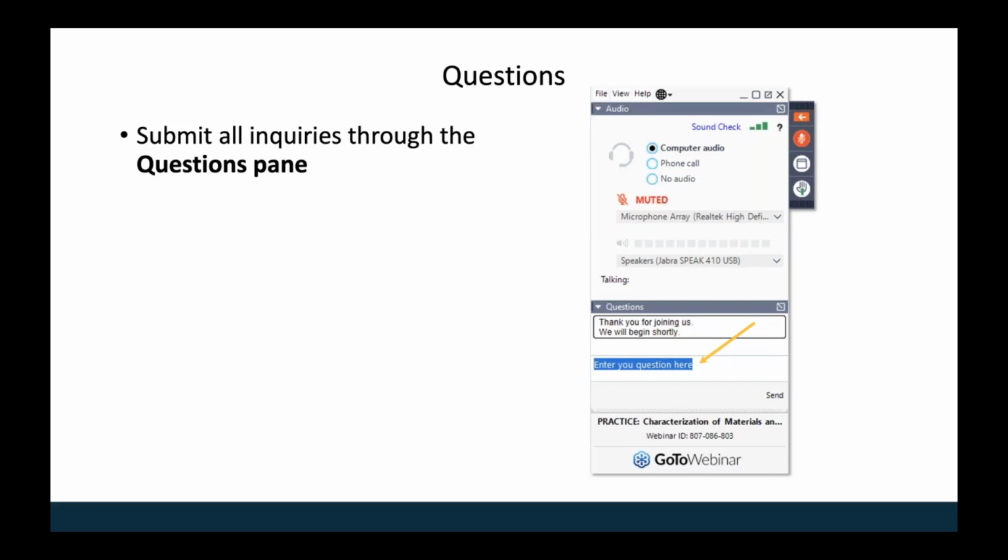Okay. And another question, Colin, great talk, thank you. The question is, how did you simulate the plasmon contribution to diffraction? In the laziest way possible. So plasmons essentially have a Lorentzian distribution. And so if you just pick a characteristic energy and figure out what cross-section you want to use, you can compute the Lorentzian distribution and then either convolve it with your pattern, which is what I should have done, or just add it to the pattern, which is what I did do.